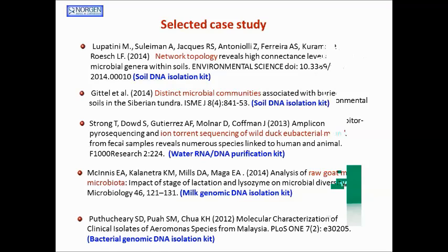To minimize this, the original sample can be preserved chemically using preservatives. The benefits are that you can ship the samples at room temperature and preserve the intact biological information from the site of collection to the facility for DNA extraction. It is convenient since you don't need a bulky ice pack or cooler, and it is more cost effective for long distance shipping.